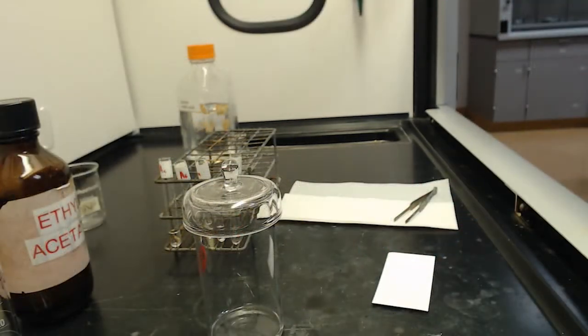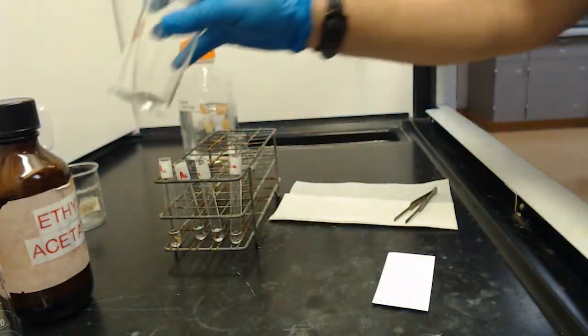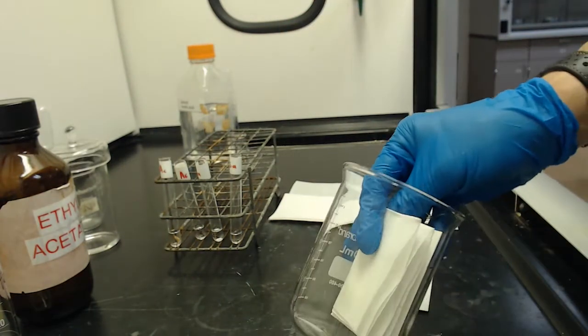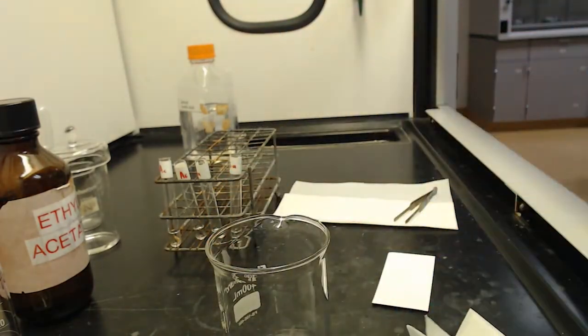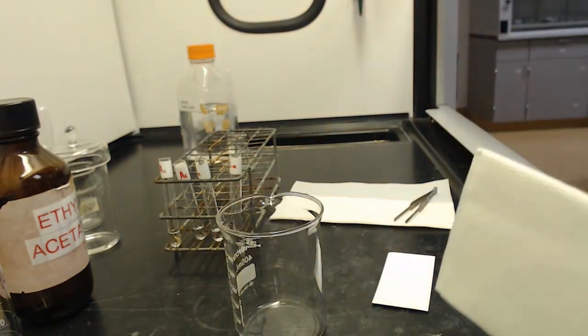Okay, so I mentioned earlier when I was doing the last TLC chamber that I had a more low-tech way to do this. So I'm going to do the second one the old-fashioned way. We're not going to use the TLC chamber, even though we could, but I want to show you the alternate way. The alternative method is to use a beaker with a paper towel and a watch glass. On this part, we have to make sure we have the addition of the paper towel.